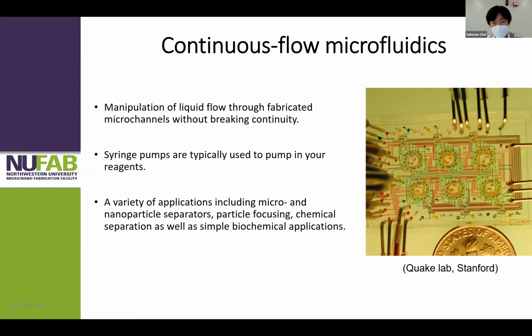Let's introduce what types of microfluidic devices there are. We have four different types, and I want to start with continuous-flow microfluidics. That's the more general type, and it manipulates liquid flow through fabricated microchannels without breaking continuity.